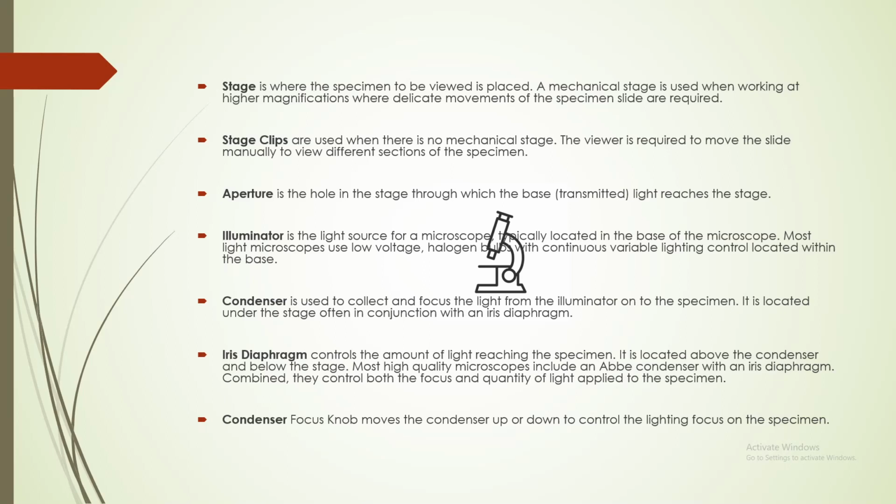And the last one is the condenser focus knob. It moves the condenser up or down to control the lighting focus on the specimen.